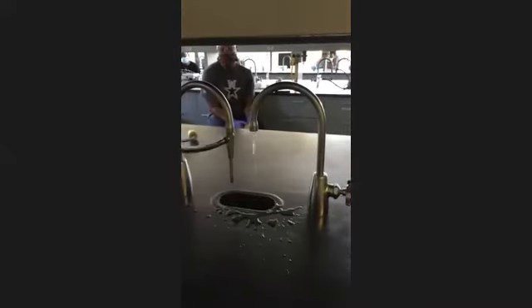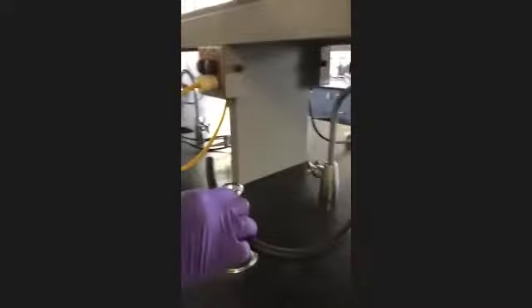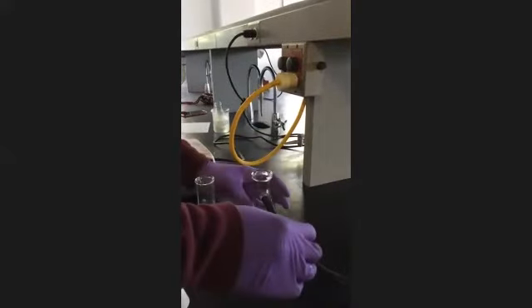All right. And so now we got that part set up, and then we're gonna set up the flask, and the same thing if the tubing is really tight. You can just wet that a little bit. And that tubing should go right on. Come on, get on there.